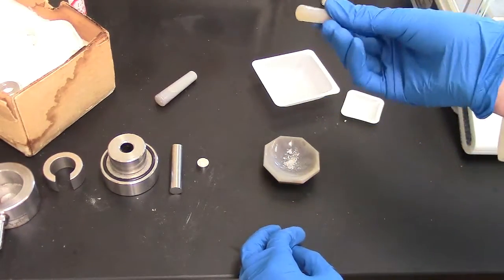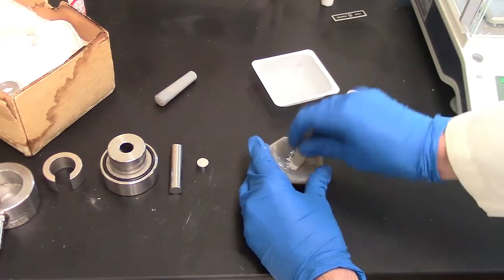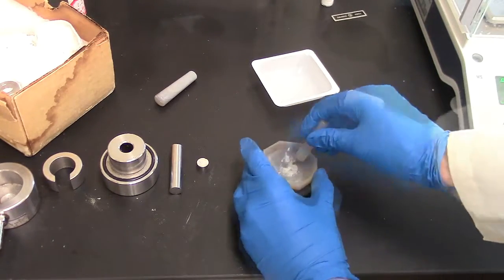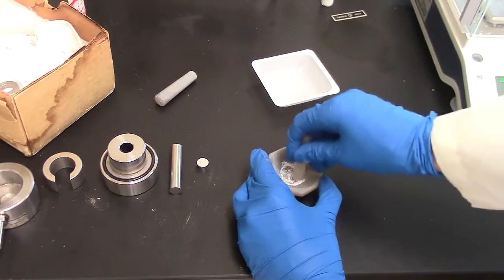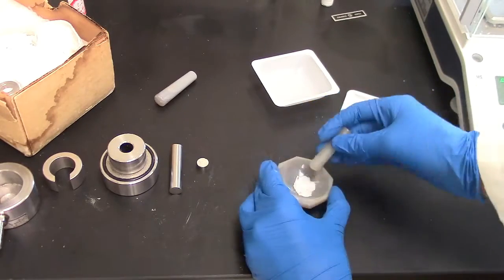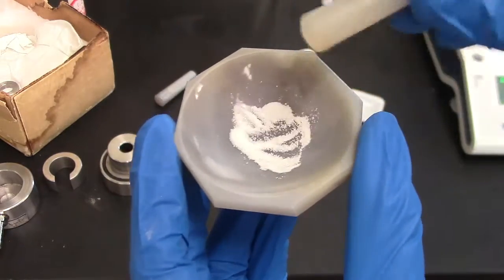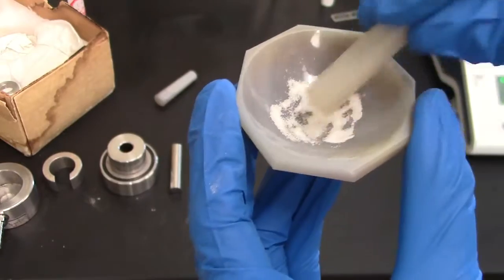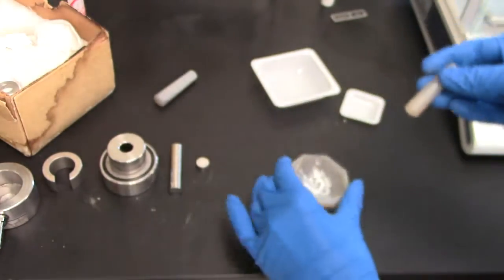Now we take this little pestle and crush our KBR and our substance together in the mortar. We're going to grind it into a nice fine powder, or as fine as we're able to. So it started out as large crystals, but you can see that it's fairly fine now. Think of it closer to powdered sugar than salt crystals.